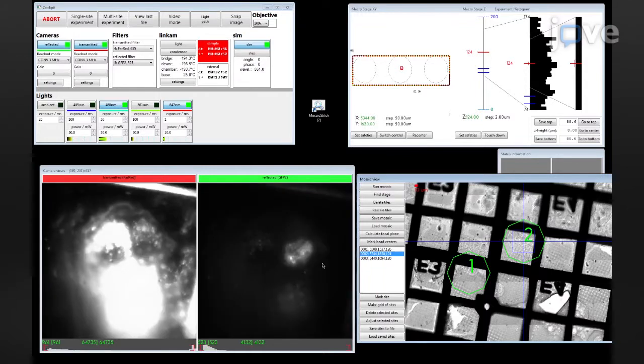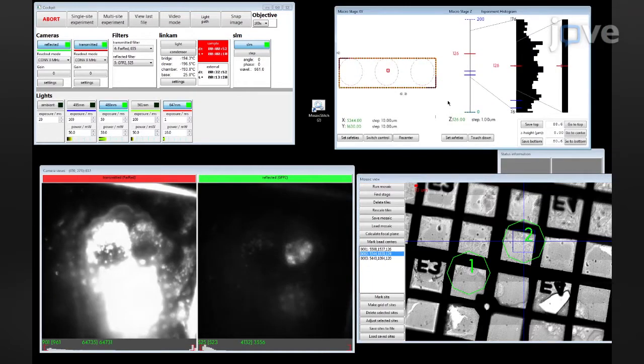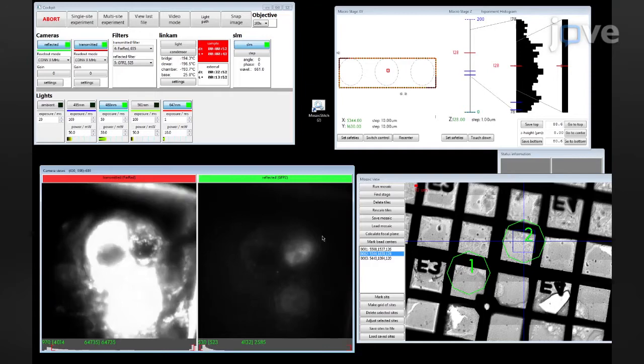CryoSim is a powerful tool that provides insight towards understanding cellular ultrastructure dynamics in response to internal or external cues. Its applications include vaccine production and rollout, quality control, post-market surveillance, antibody engineering and optimization, as well as nanoparticle characterization.